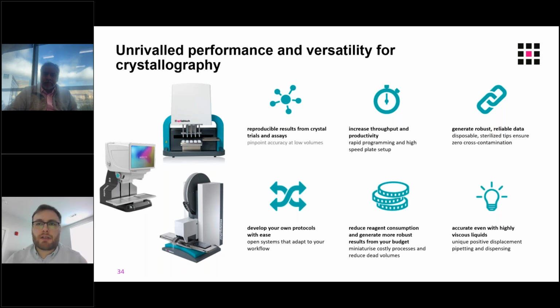But yes, it depends exactly on what crystal screens you are using. Although I've mentioned Hampton a few times, there are many other commercial ones available. So that would be a question more for the specific manufacturer of that crystal screen. In practice, I can add that I've not seen azide being added anywhere to these screens too.